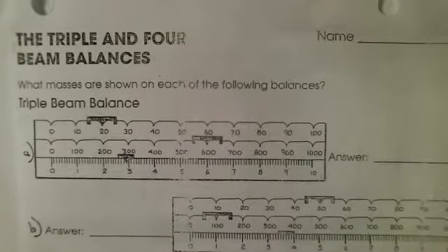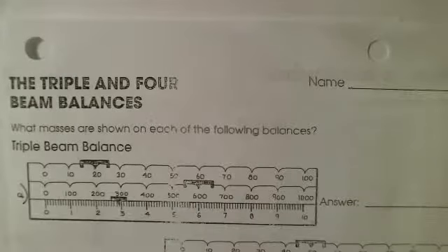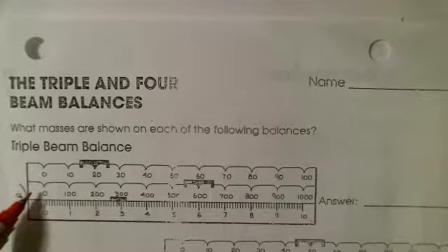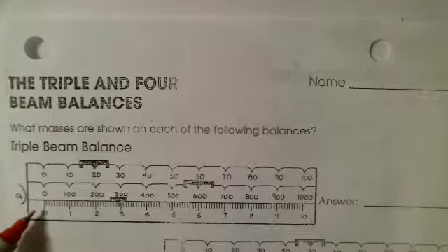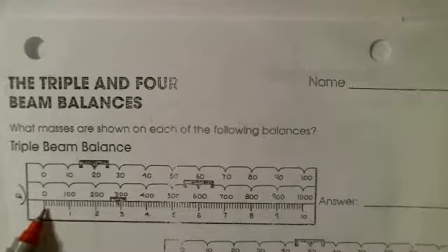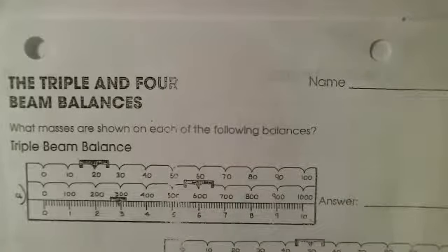Let's go ahead and do an example here as well. All right, so on this first one, the top beam, that's your tens. These are your hundreds. These are your units. But you see that your units are separated into tenths or the first decimal. Okay. Therefore, our answer will have a number in the hundredths spot. And the number in the hundredths spot or the second decimal place, that's the one we will be estimating.